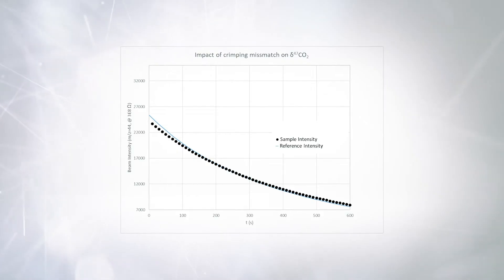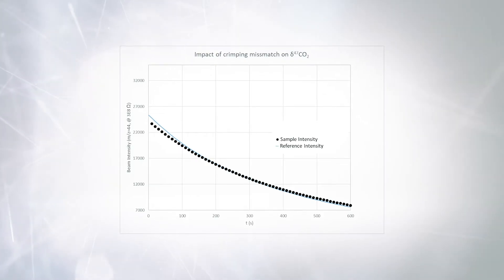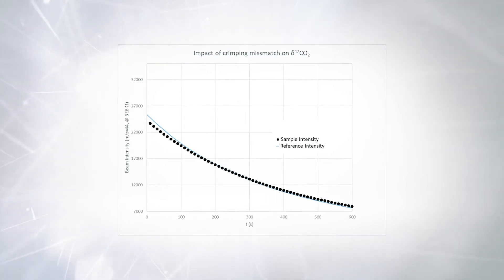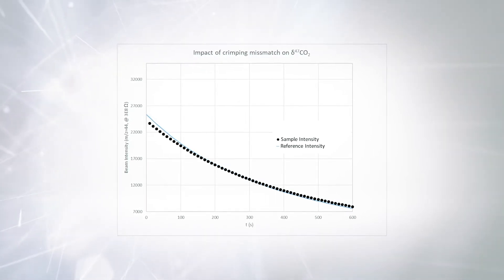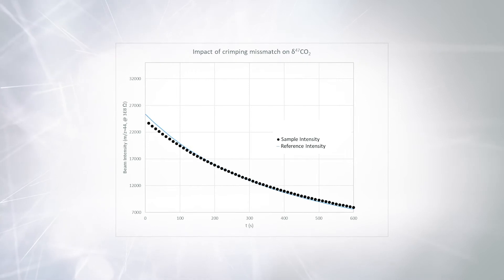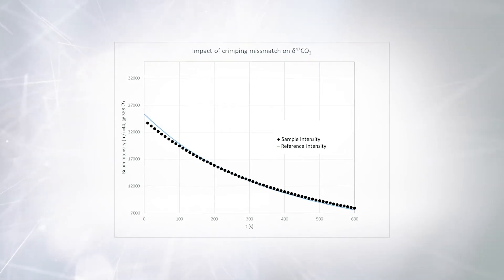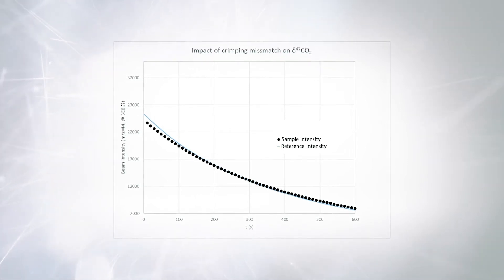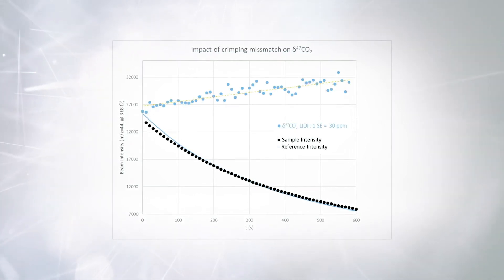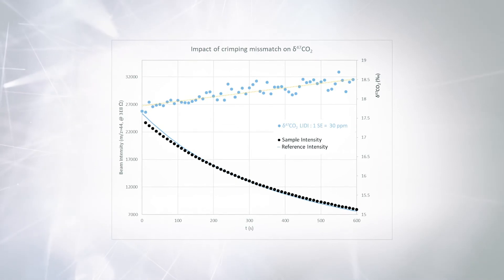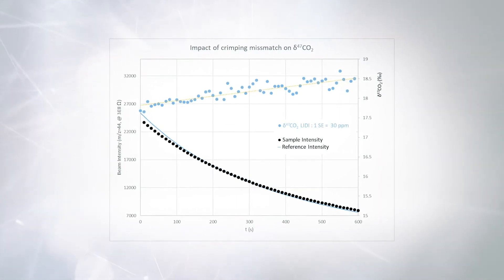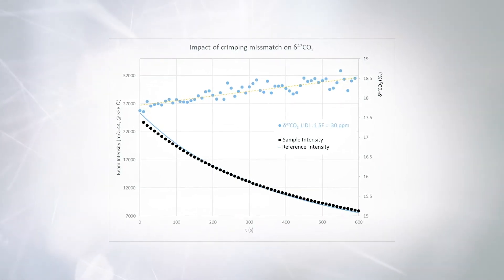With the previous software solution, the intensity decays of sample and reference signals show a mismatch due to non-perfect capillary crimping and the pressure adjust, as shown in the figure. This causes a visible trend in the resulting delta 47 CO2 data depicted in blue.